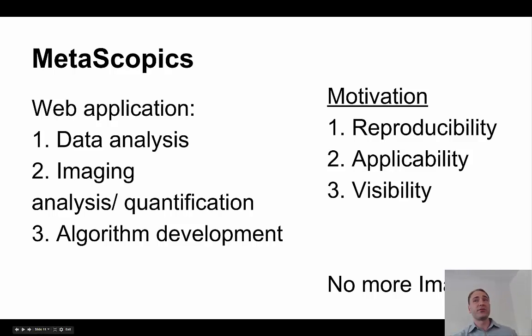algorithm works and how it does a really good job of identifying whatever it is you're looking for in cells or parasites or what have you, they can take your algorithm and directly apply it in their own projects and directly apply it to their own data once they've uploaded their data onto the web application.